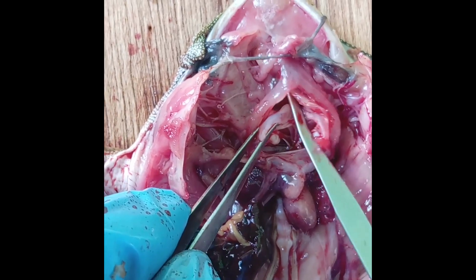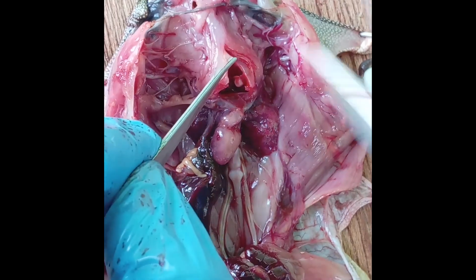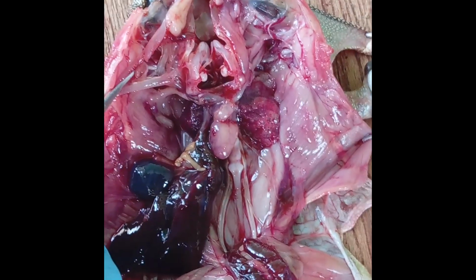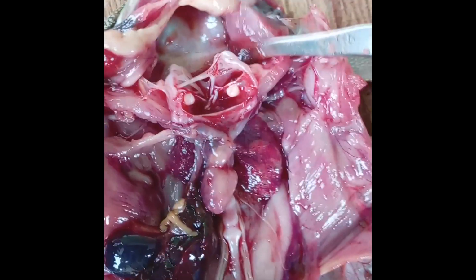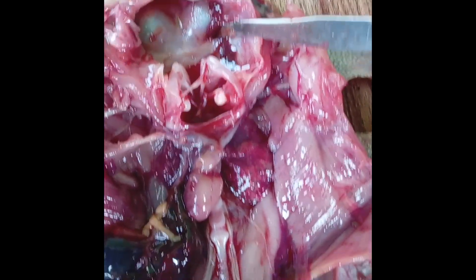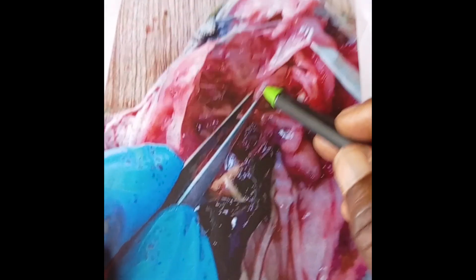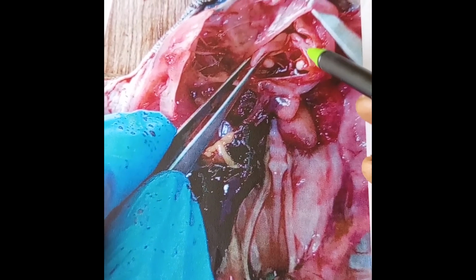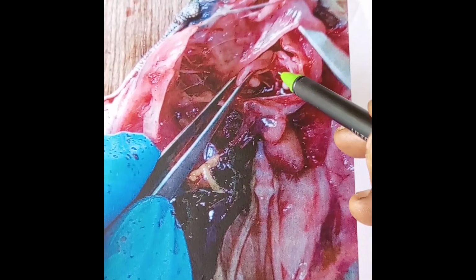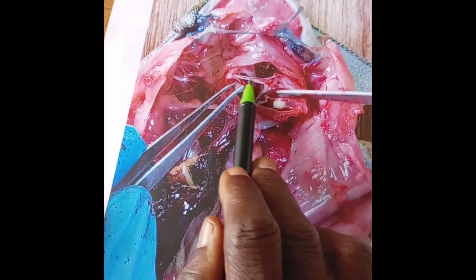The chamber is connected to the buccal cavity. So we are cutting through the floor of the buccal cavity, and here we have the buccal cavity opened, and you see the structures in the laryngotracheal chamber still. These are the arytenoid cartilages. There are two. They control the glottis. So you can see when they are pushed out, you can see the glottis there as a whole.